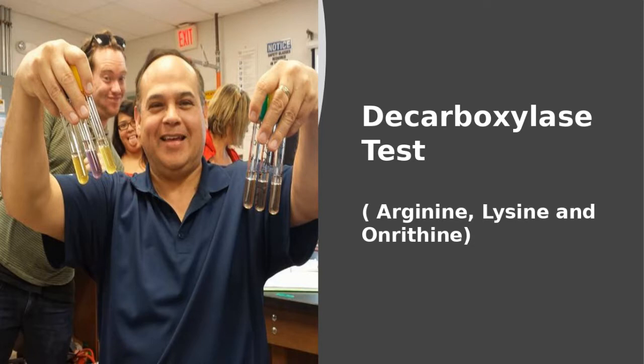Anyway, we're going to talk about the decarboxylase test. And in the decarboxylase test, there are 3 possible substrates. They are arginine, right, which is an amino acid. It can be lysine, another amino acid, or ornithine, another amino acid, right? So these are not in the same tube.